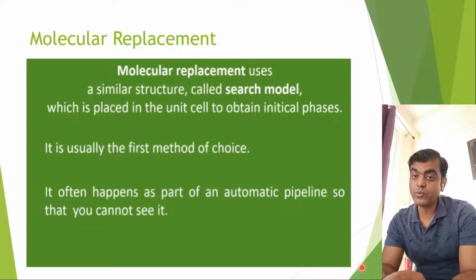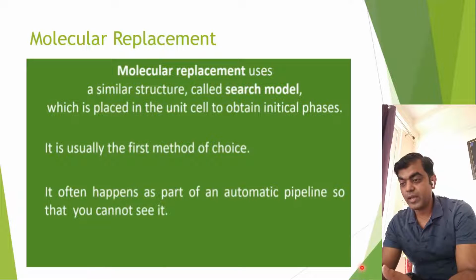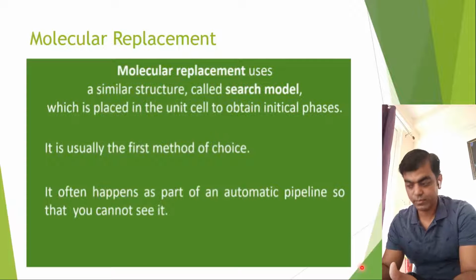This is usually the first method of choice of most crystallographers, and it often happens as part of an automatic pipeline, so that you cannot see it. The software algorithms these days don't tell you, they do this automatically, right?